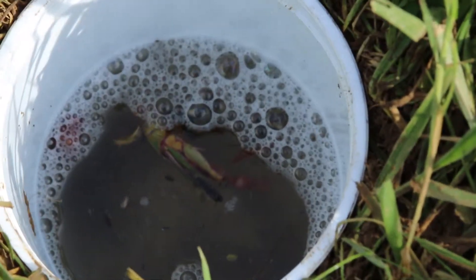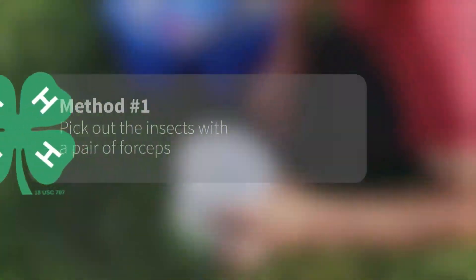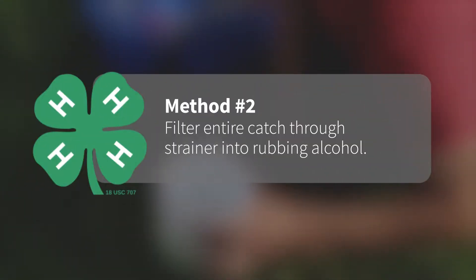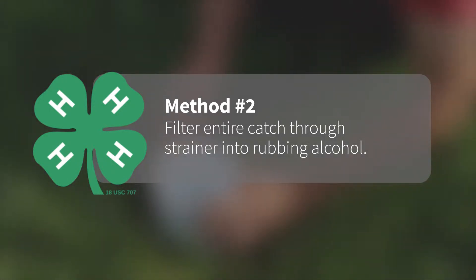After you have found some insects in the pitfall trap, you can either pick out the insects from the trap with a pair of forceps, or dump the entire catch through a finely meshed spaghetti strainer into a cup of rubbing alcohol.